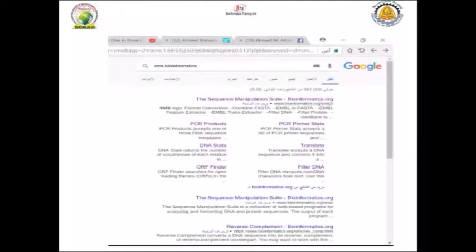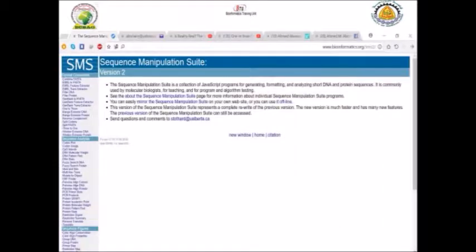To find the Sequence Manipulation Suite, just write in Google 'SMS bioinformatics' and the first hit will be the Sequence Manipulation Suite. On the left-hand side of the website, you will find the tools divided into different sections.